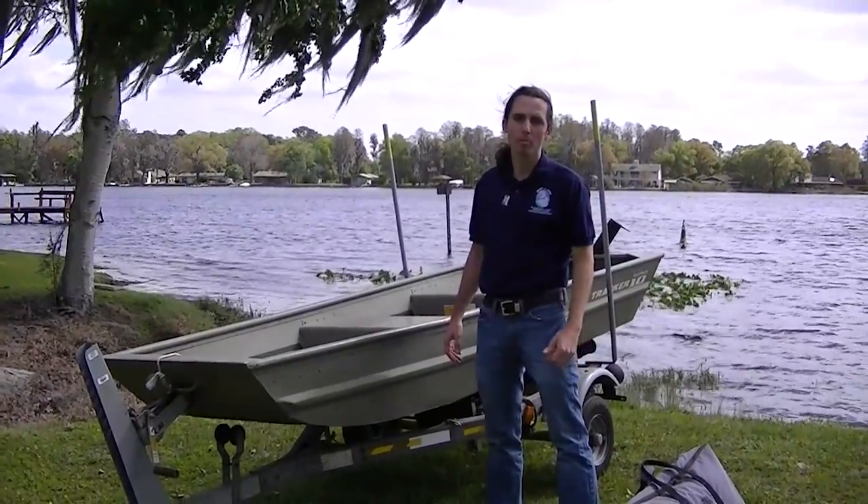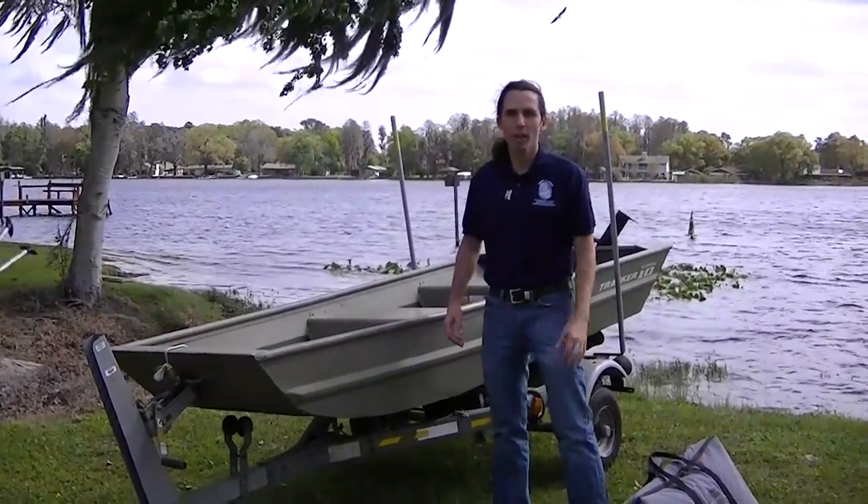Hi, it's John with the Stormwater Environmental Programs, and it's Lake Sampling Day. So we're going to show you how we do it. Come along.